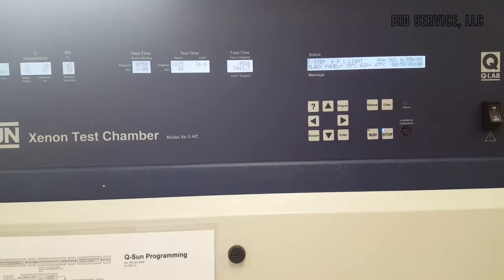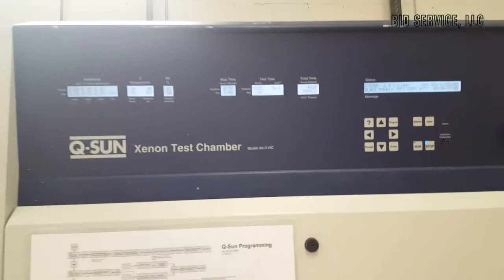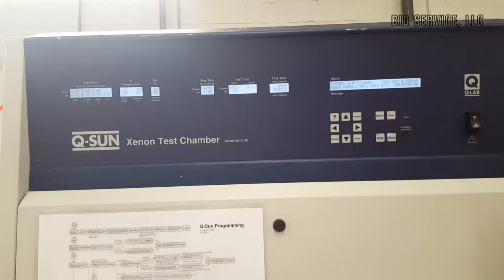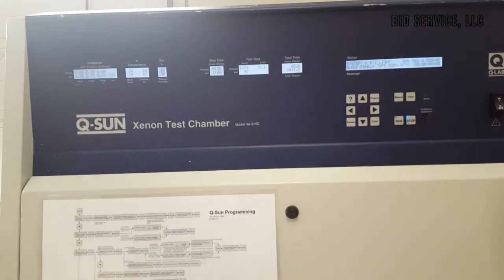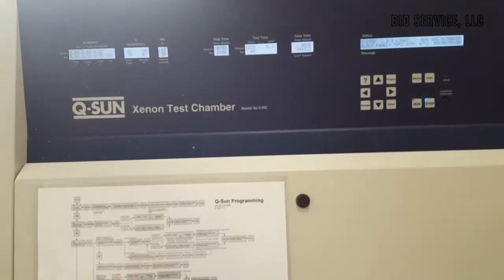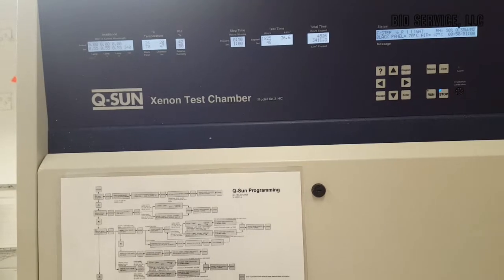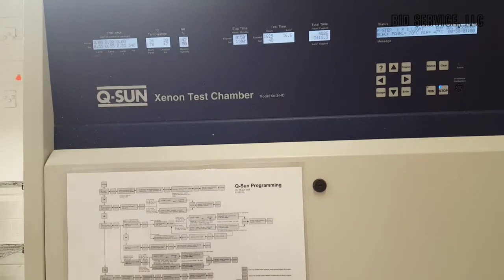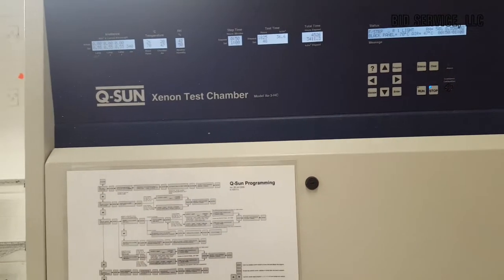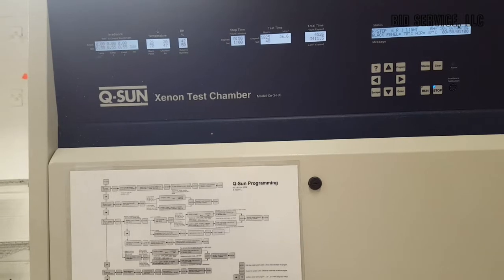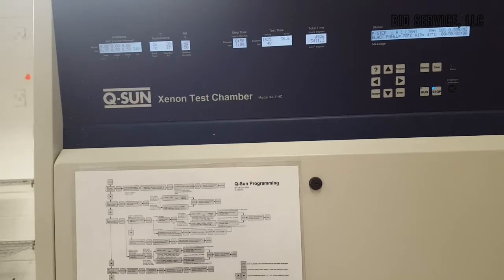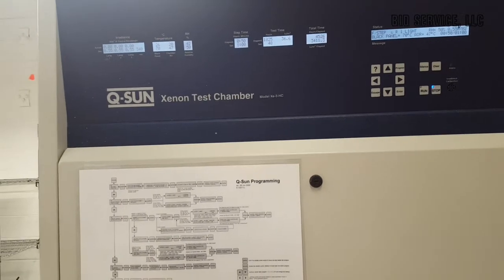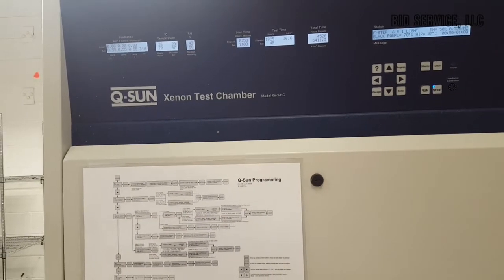Now, I have the option at this point now of either having the Xenon light source come on, or having it completely dark, which would be the difference between weathering, between, let's say, bright sunlight during the day and when it's at night and it's very dark.